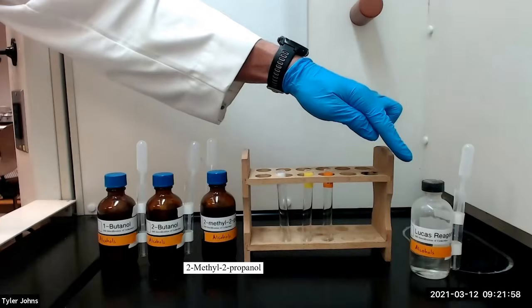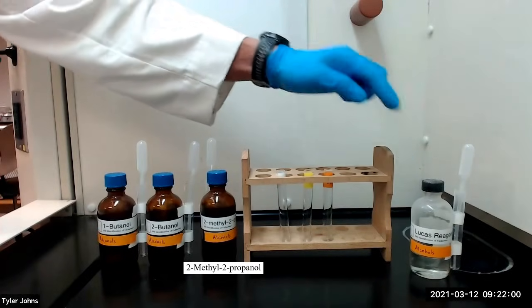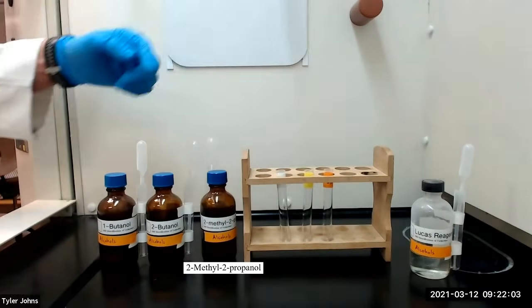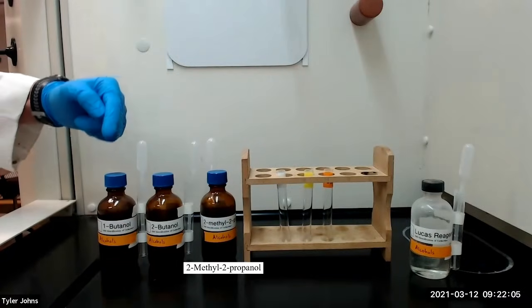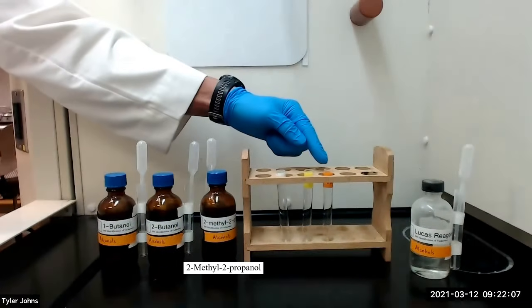We will begin by placing 2 mL of the Lucas reagent in 3 separate test tubes. We will then add 3 to 4 drops of the alcohols into the corresponding test tubes.